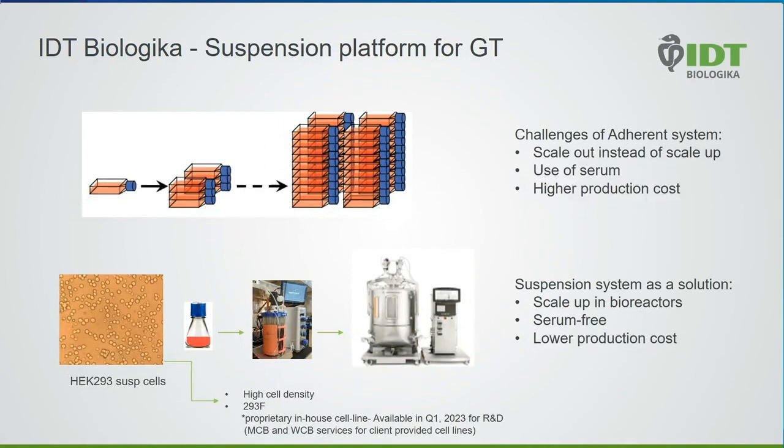So our platform uses a suspension system or a suspension cell type. And the reason for that is because of the challenges posed by the adherent system. Some of the key ones are that the adherent system is more of a scale-out type arrangement than a scale-up type system. And this is one of the main reasons that there is a limitation on how much you can scale up. And the other important factor is the use of serum. Adherent cells often need the use of serum, which becomes a challenge from a regulatory perspective.